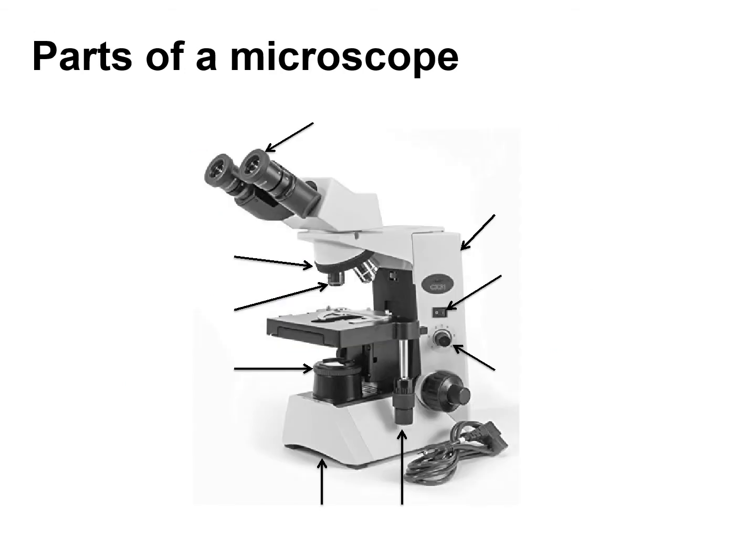Let's talk about the parts of our microscope. So up here would be your ocular lens. So the eyepiece or the ocular lens. And basically this is what you look through at the top of the microscope. And as I said, typically your ocular lens, they have a magnifying power of 10x. And again, that number is going to be written right here on the side of your ocular lenses. So that's the ocular lens right here.